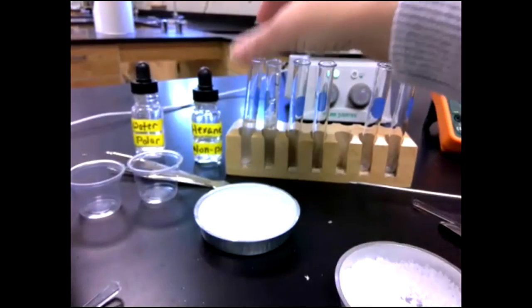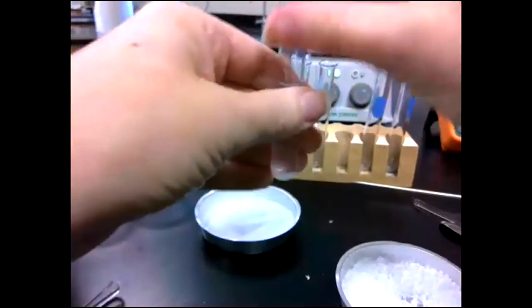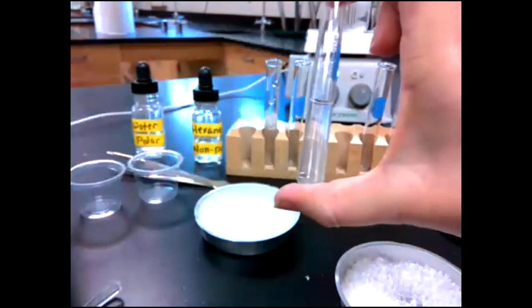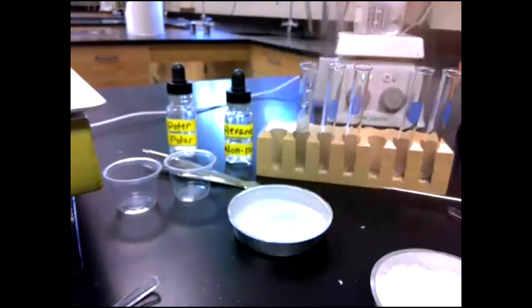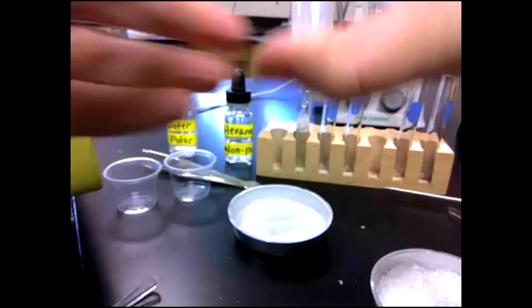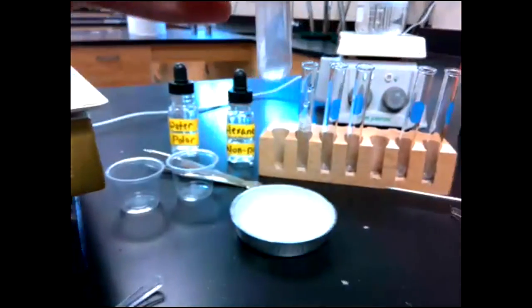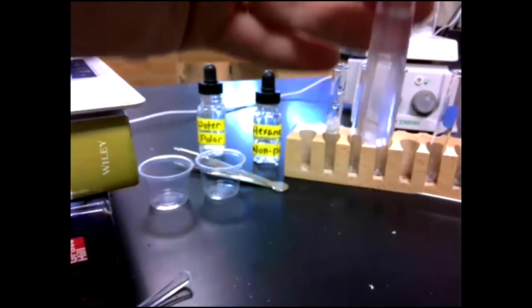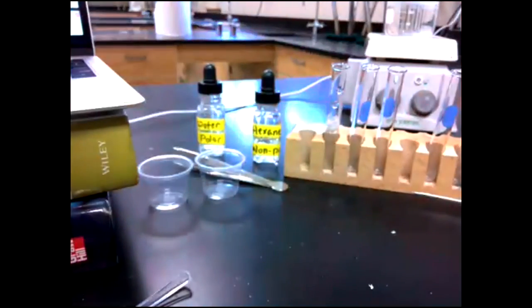So to see if they dissolve, we could wait like half an hour, but it's faster to shake it. So I'm gonna just shake this up. Try not to rattle the camera. So this is A in water. And it definitely dissolves. Not quite all dissolved yet, but it should all dissolve eventually.